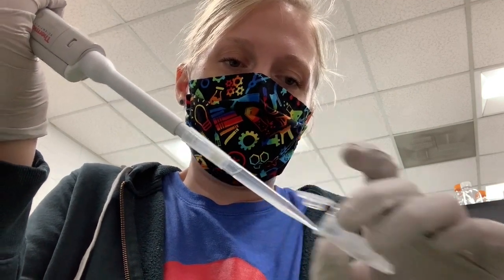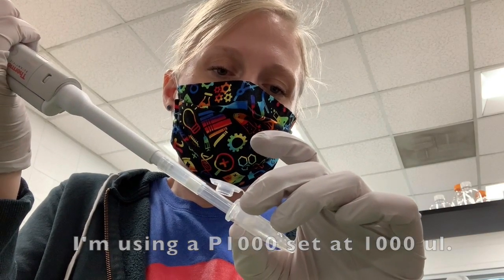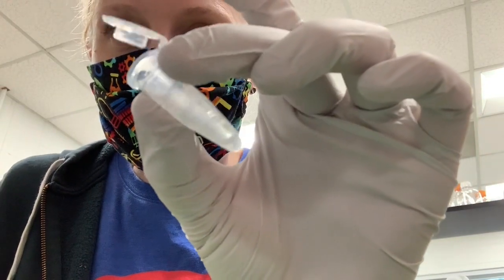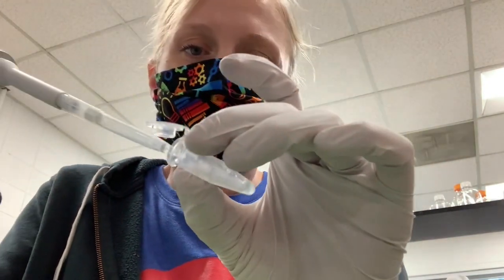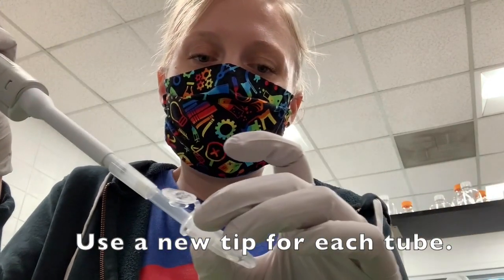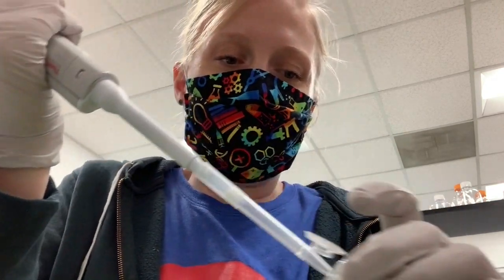Remember, I'm doing a double reaction, so I may have a little bit more liquid in here than you have. What should be left is just that little pellet on the bottom. You may see some of the pellet up the side too. You want to remove as much of the liquid as you can, although that's more important after the next step. And I will say you want to make sure that the centrifuge is closed while you're doing this so that it stays cool. So just make sure that you've done that. And I'm just being very careful not to disturb the pellet.